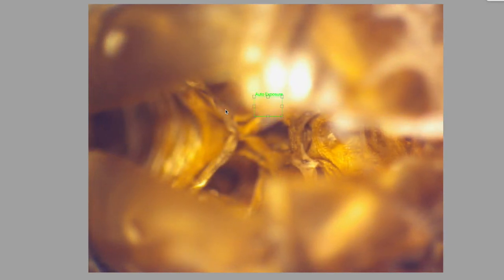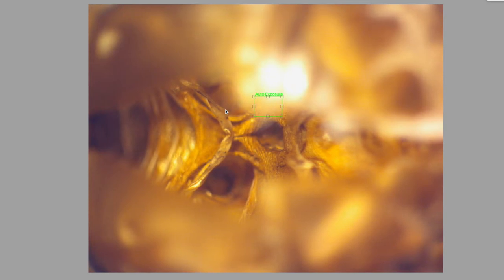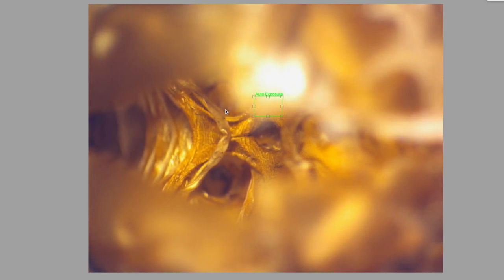Oh, I'm so happy. Okay, we're at 10x. Let's see what we can see here. First of all, I want to see down inside. Now, all insects do not have an interior skeleton. They have an exoskeleton. I'll take a picture of that. So that would be part of one of the holes where the legs go down, and this would have been the central... I don't know what you want to call it.